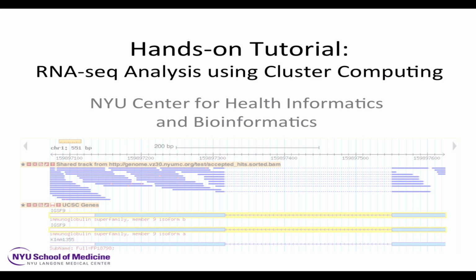So I'm batting cleanup for this workshop. The last section is how to do analysis of the data that you receive back from the sequencing lab. I'm going to review some things that Adriana just said and a fair bit that was said yesterday, and I'm going to go really quickly. So if a question comes up, stop me and we'll go over it and make sure that you're clear. The whole point of working up to this is because I want to get to some shell scripts and have you know what I'm talking about.